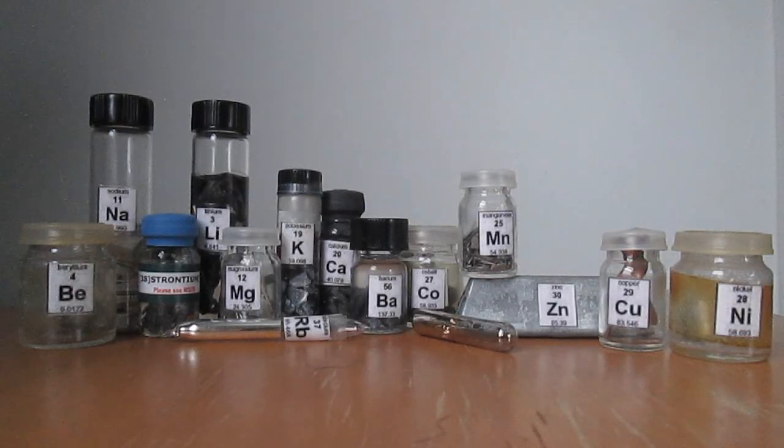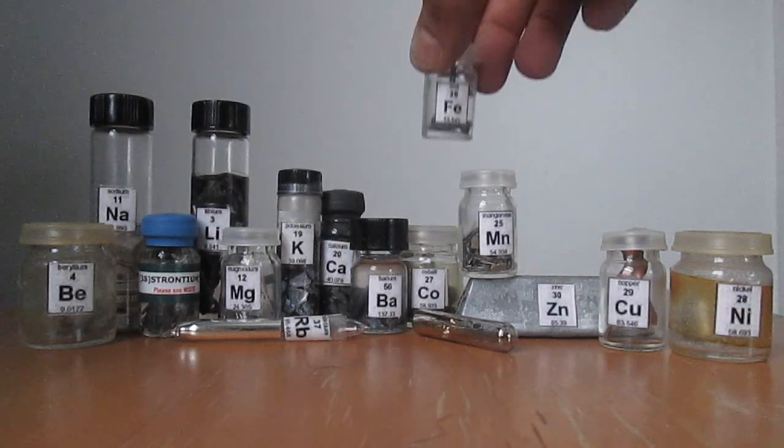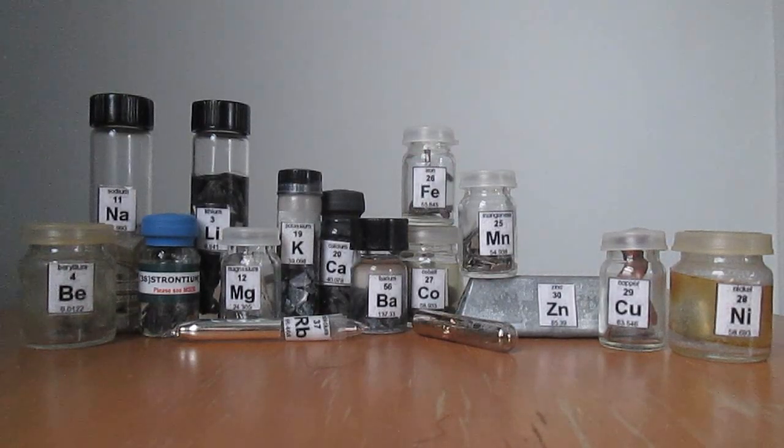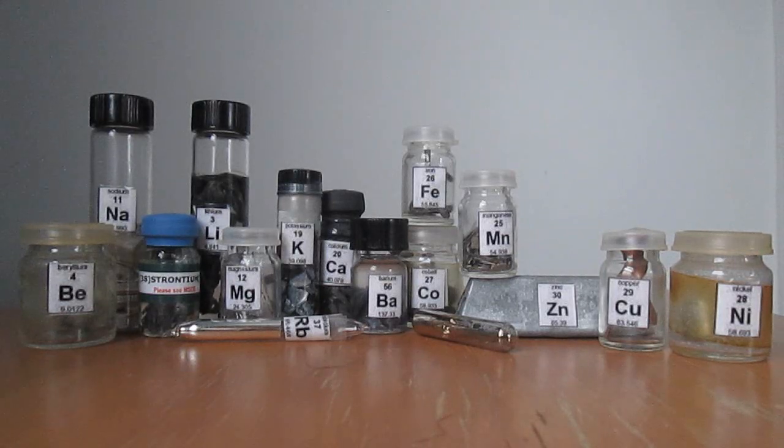On the cation side, I'd like to try for all of these metals and the ammonium ion.